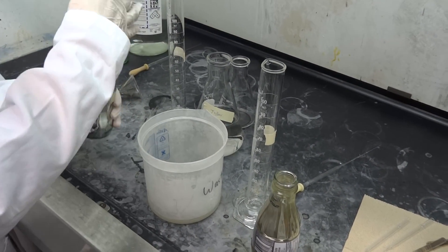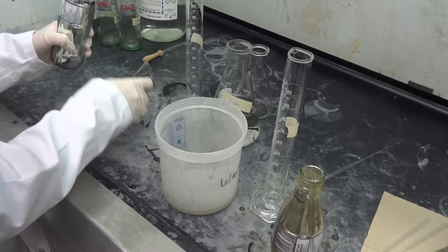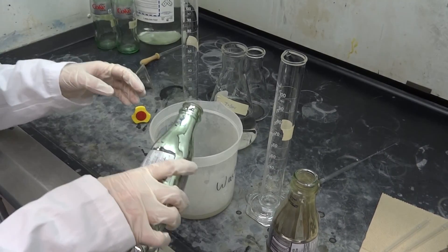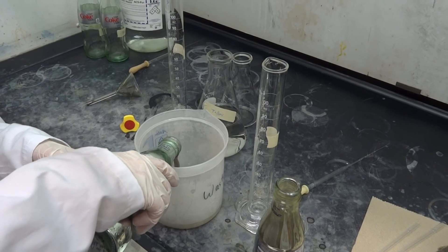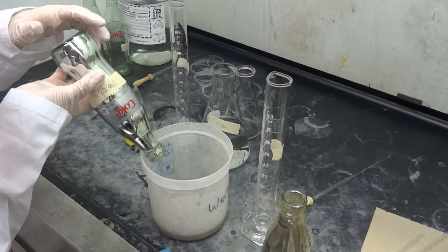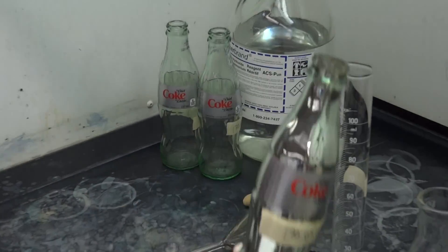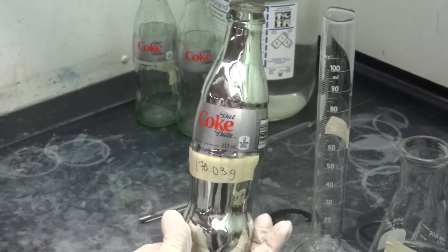Alright, get rid of it. So we're going to dump out the liquid. And now all that we need to do is rinse it with some distilled water. Beautiful. And that is a silvered Coke bottle.